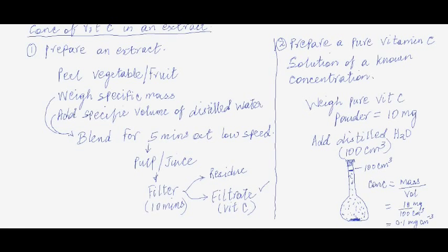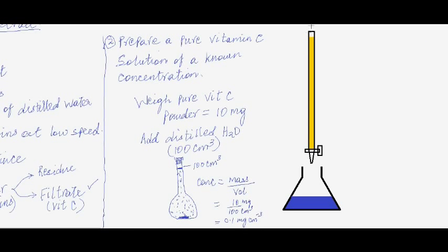Now the third step is step 3, titration of the vitamin C solution. Now what we do during this procedure is, to make the procedure more accurate, we first of all wash the burette.